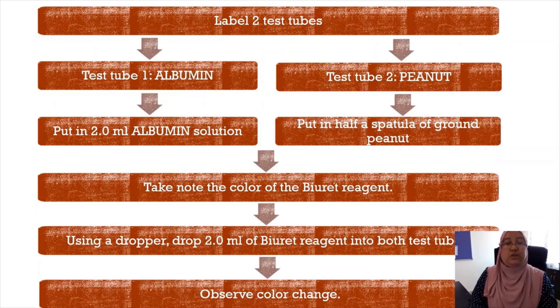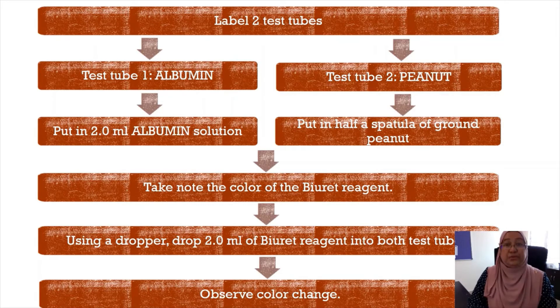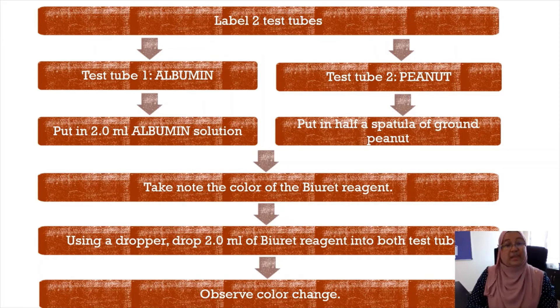Label two test tubes: test tube one for albumin, test tube two for peanut. In test tube one, put in 2 ml of albumin solution. In test tube two, put in half a spatula of ground peanut. Take note of the color of the Biuret reagent. Using a dropper, add 2 ml of Biuret reagent into both test tubes and observe any color changes.